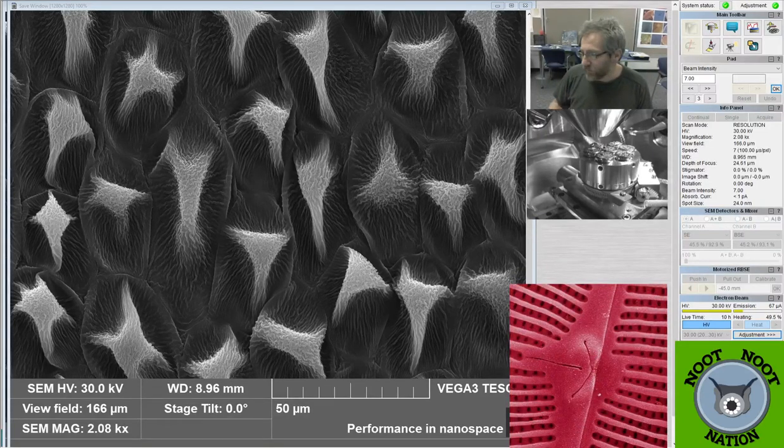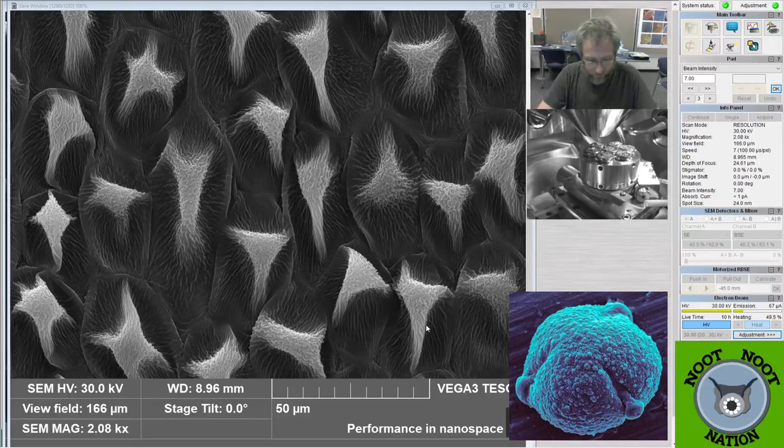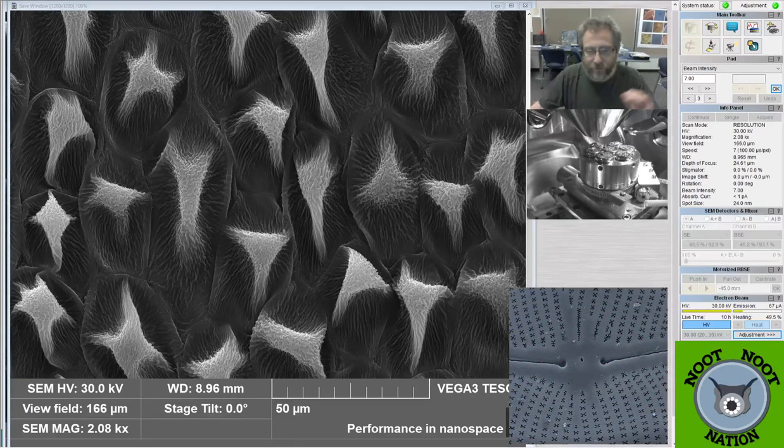And I cheated a little bit and stuffed 2 on one stub, somewhere around stub 6, because I didn't know if they would have pollen in them. Some of these I wasn't totally sure. So this is actually a violet. So I'm going to type this in. We're looking at a violet flower petal, actually. No pollen in that image, but we're going to look at the pollen if I can find some.